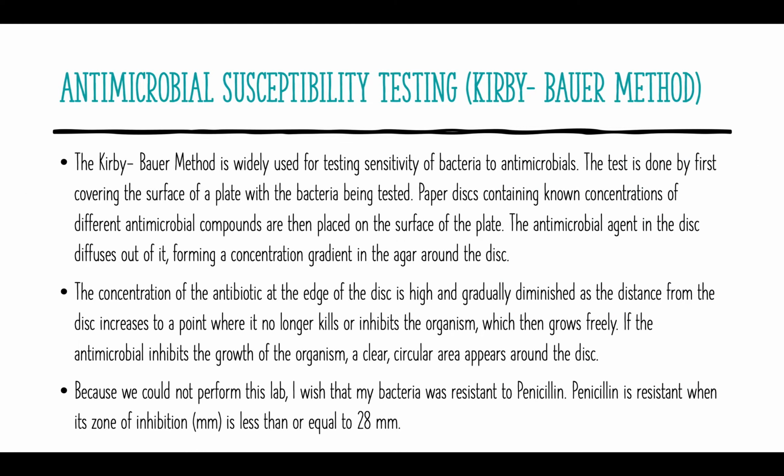The last test that we did, or the last lab that we did, is the antimicrobial susceptibility testing, or the Kirby-Bauer method. The Kirby-Bauer method is a widely used method for testing sensitivity of bacteria to antimicrobials. So, testing if a patient is resistant to certain medicines, for example.